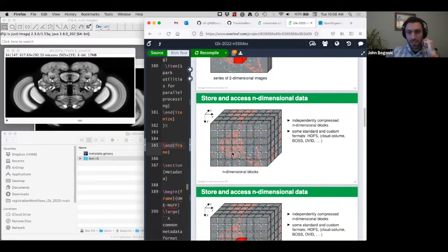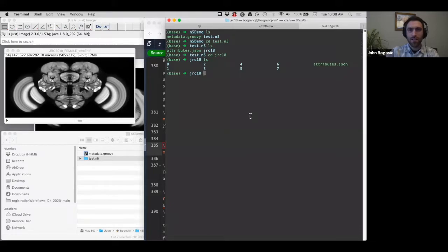The formats that I'm going to be showing today break the image up in this particular way. So every file that was just written is one of those little cubes. For example, here's a folder, and then there's 3 files in this particular folder that are 3 of those little blocks. That's all that happened.